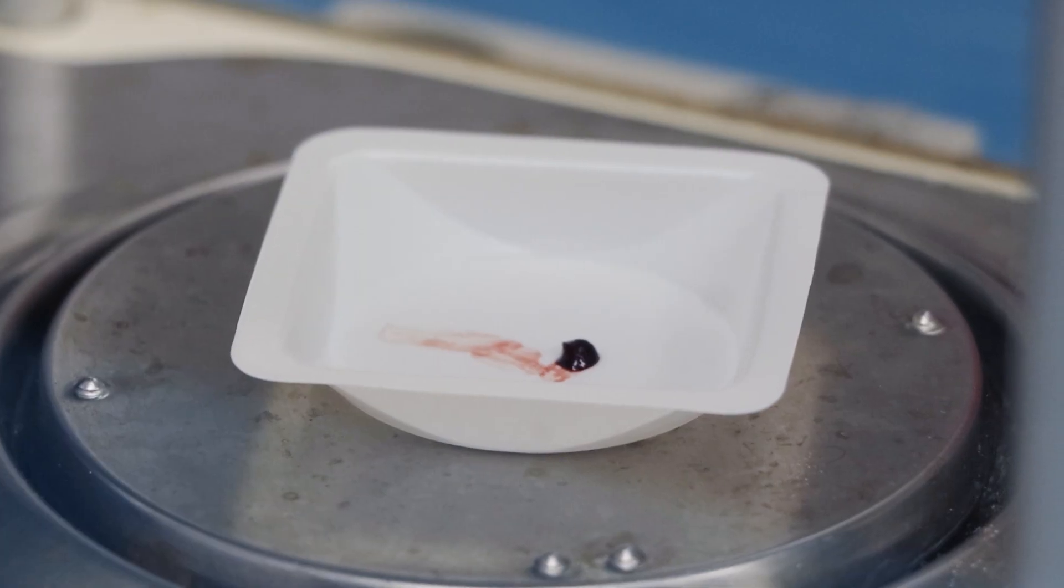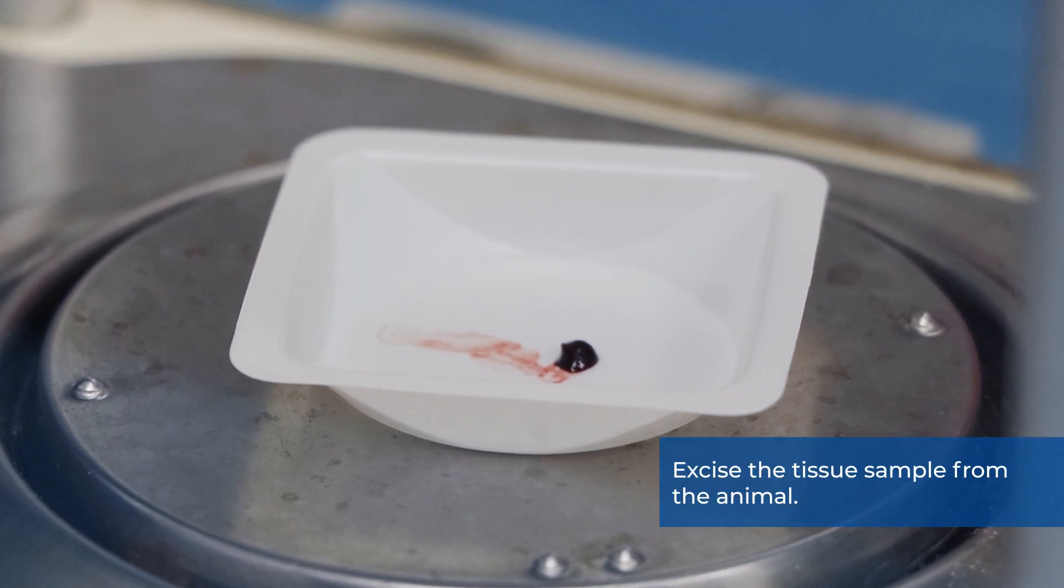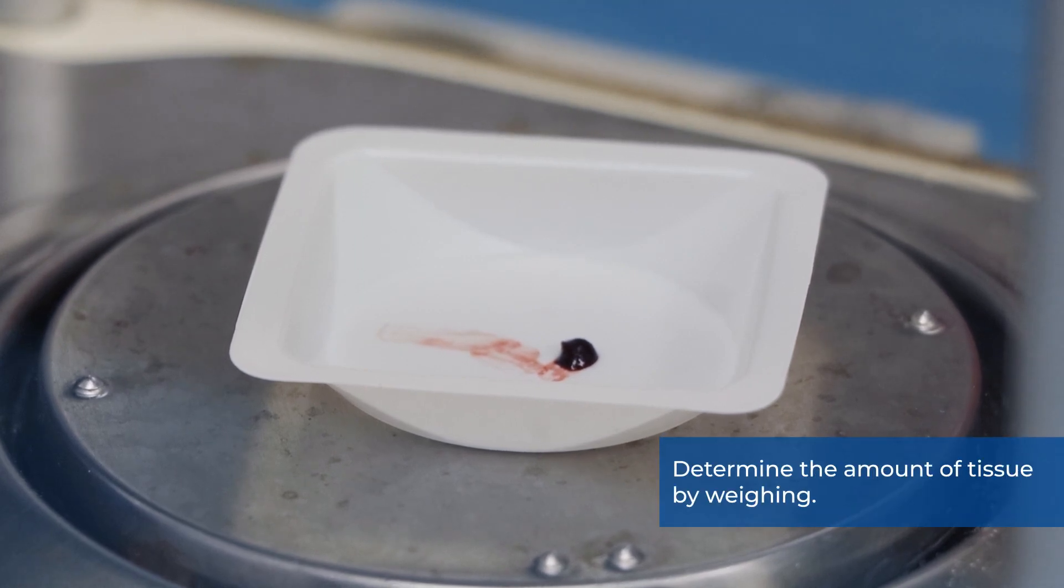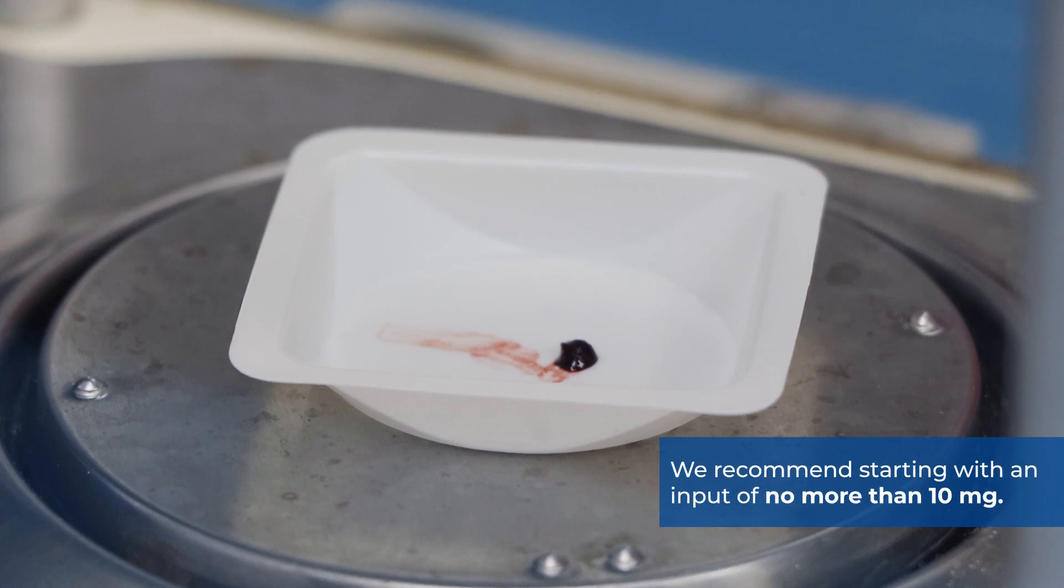Next, we will demonstrate cell lysate preparation from animal tissues. Excise the tissue sample from the animal. Determine the amount of tissue by weighing. We recommend starting with an input of no more than 10mg.